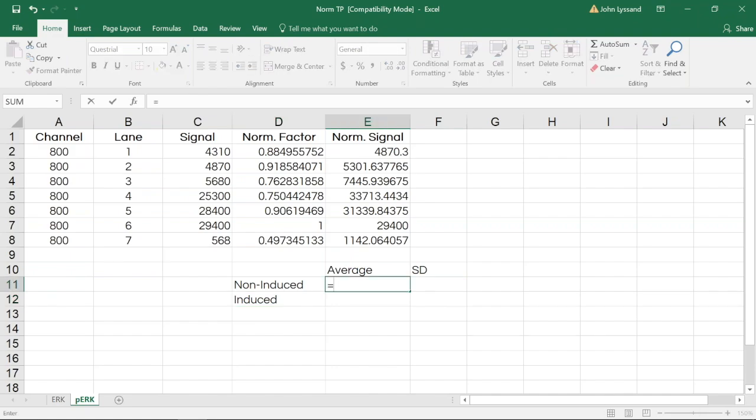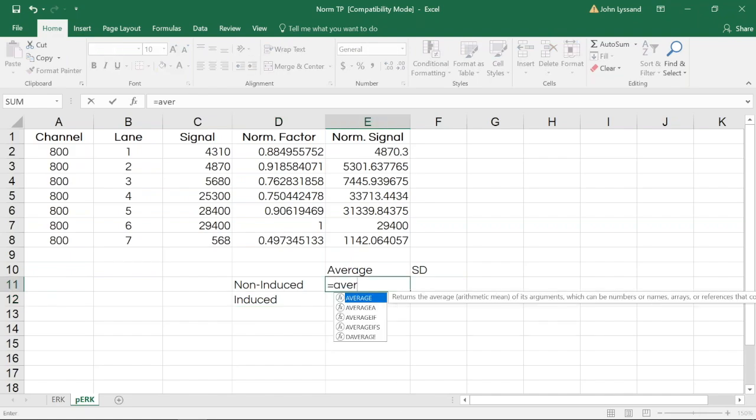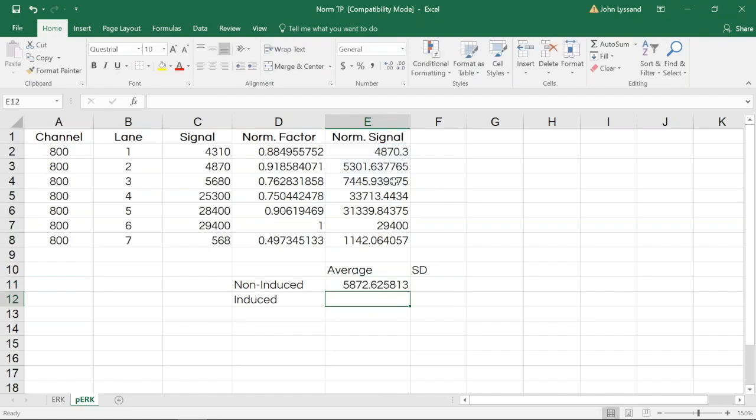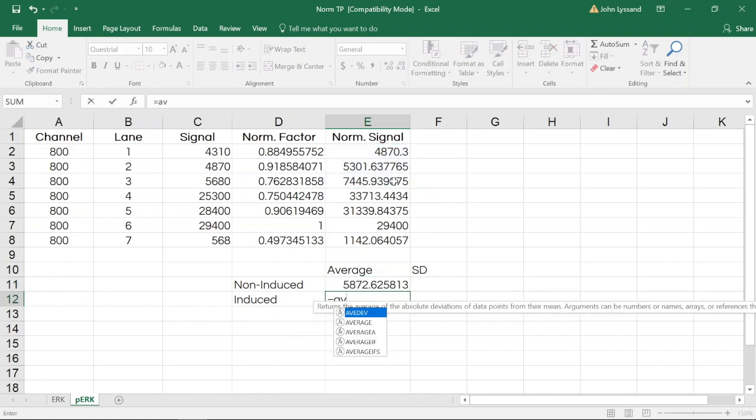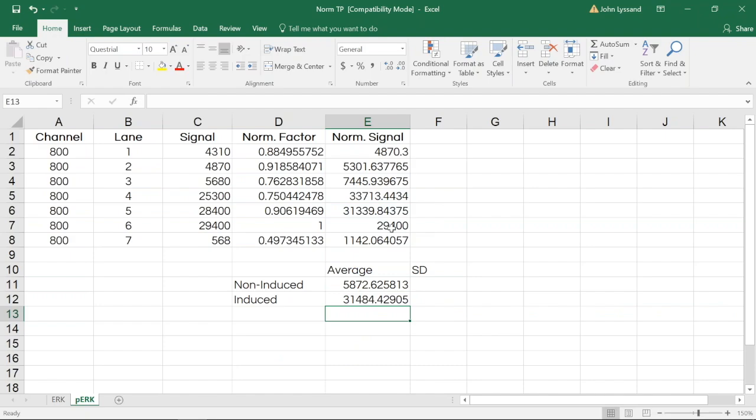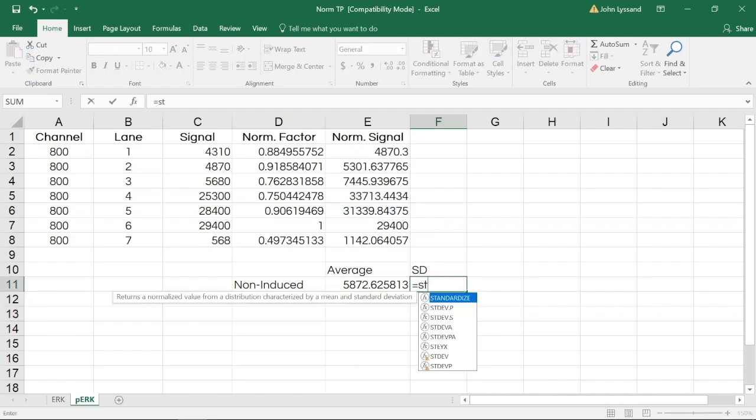Using Excel functions, we can find what the average of each of these sets are, as well as what the standard deviation of each was.